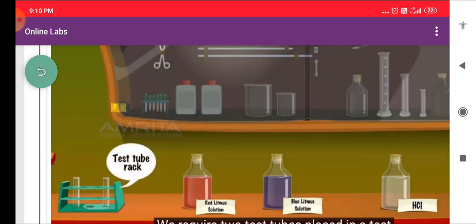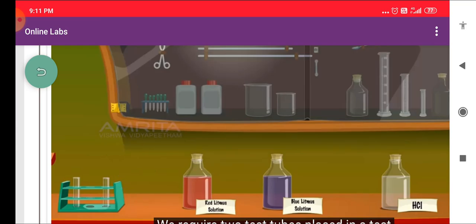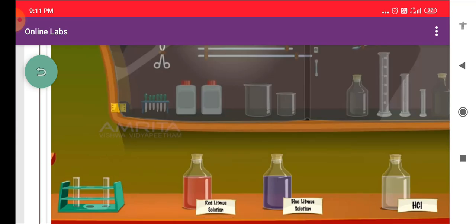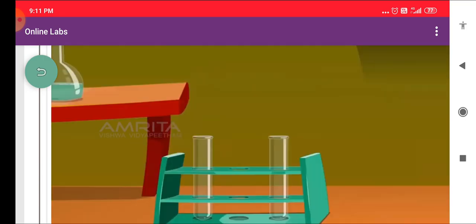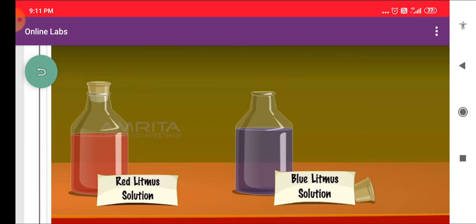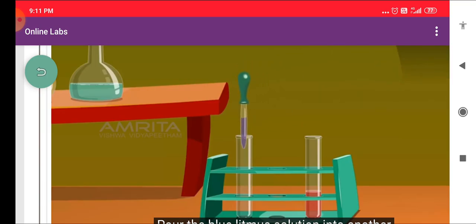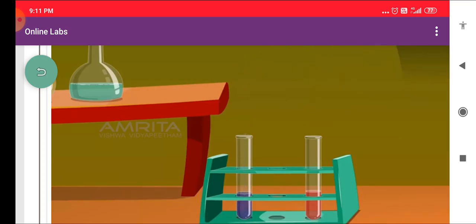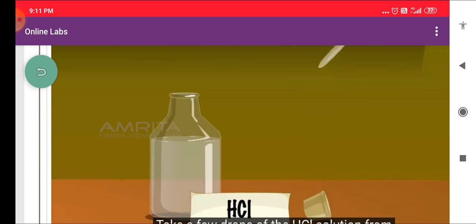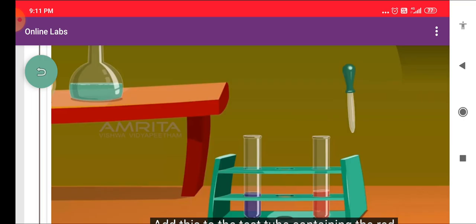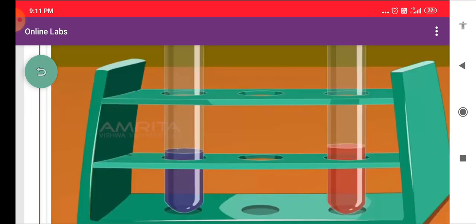We require two test tubes placed in a test tube rack, Red and Blue Litmus Solutions, HCL Solution, and a dropper. Take the Red Litmus Solution and pour it into a test tube. Take the Blue Litmus Solution and pour it into another test tube. Take a few drops of HCL Solution from its bottle using a dropper.